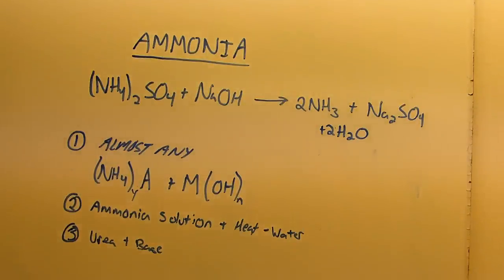Hi everyone, welcome to another Doug's Lab video. In this video I'll be generating ammonia gas using a common laboratory method, as well as discussing some other laboratory methods and things to watch out for when using them.